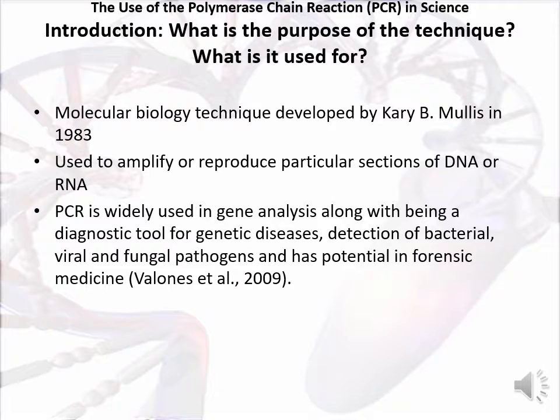Polymerase chain reaction, commonly referred to as PCR, is a molecular biology technique developed by Kary B. Mullis in 1983, which is used to amplify or reproduce particular sections of DNA or RNA. One can start with a single molecule of DNA, and the PCR can generate 100 billion molecules in a short period of time, as each copy will increase exponentially.